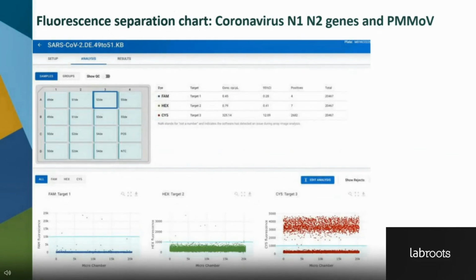We also applied the SARS-CoV-2 commercial kit on the raw wastewater samples that we extracted directly. The kit has 3 targets inside, and we can quantify SARS-CoV-2 N1 gene, N2 gene, and PMMoV gene together. PMMoV is a plant virus, and it is found to be the most abundant RNA virus in human feces. Here it is used for quality assurance in the SARS-CoV-2 assay from wastewater.